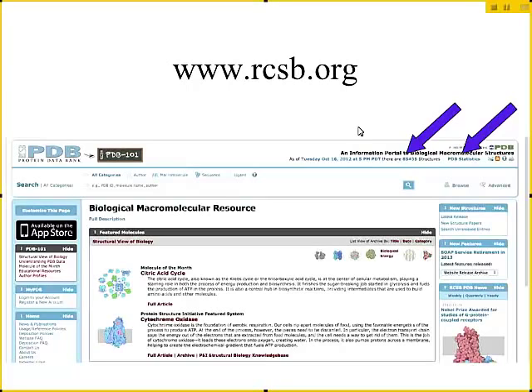If you go ahead and pull up a browser — Firefox, you should have one on your terminal — go to rcsb.org and you'll see a webpage that looks something like this. Up in the upper right-hand corner are the current number of structures and the current PDB statistics. If you click on PDB statistics, you'll get some information. The last time I captured this, there were 85,000 structures.